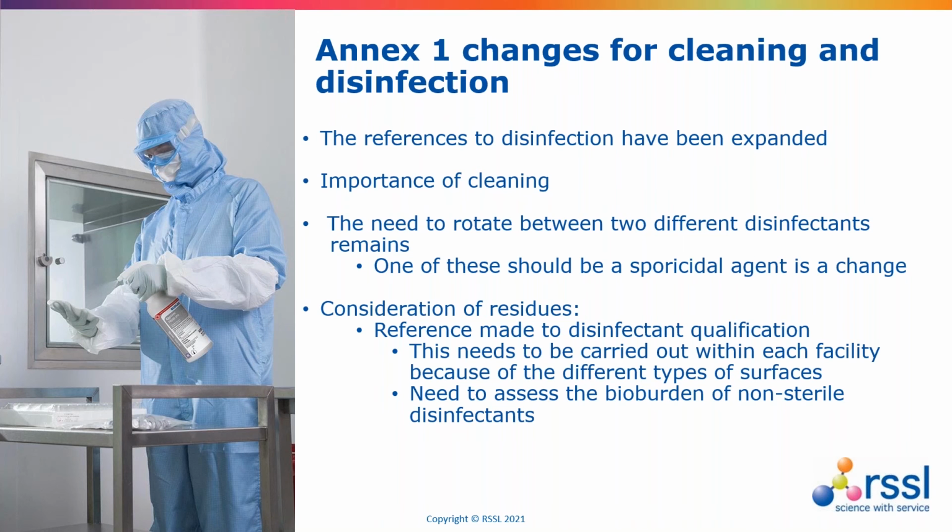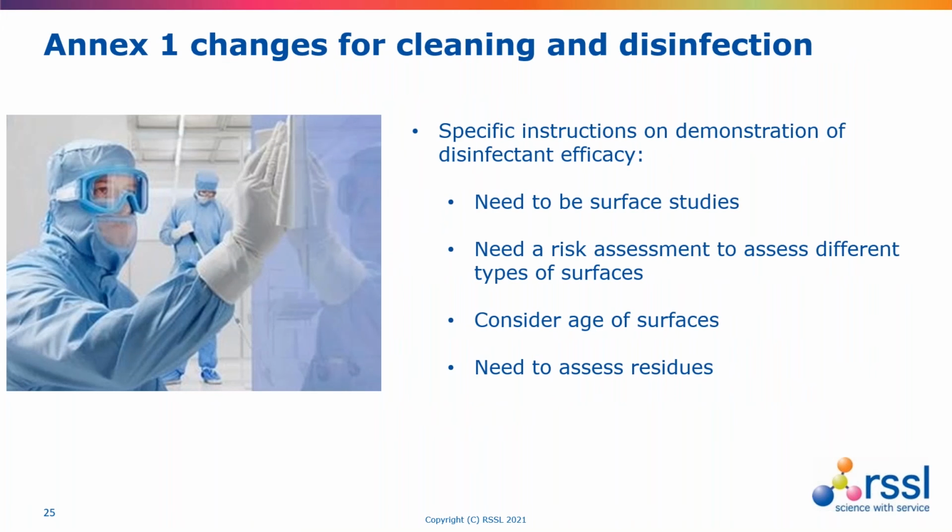And then with the disinfectant efficacy testing I spoke about, there is a very clear requirement to understand how disinfectants and different surfaces interact against an appropriate microbial panel. And this starts to come into the territory where what the disinfectant manufacturer can offer stops and what the facility needs to undertake itself begins.